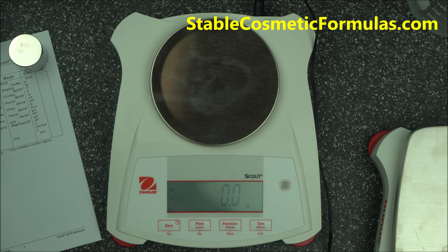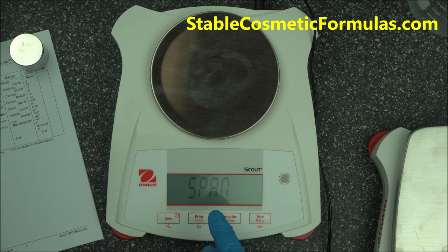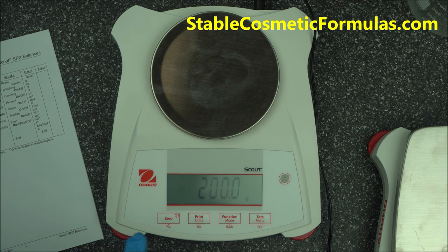To calibrate: press and hold the menu button until you see 'CAL', then press YES. When you see 'SPAN', press YES again to start the calibration. It will then tell you the weight to use. If you have the included 200 gram weight, use that. If you don't have that weight, press NO to cycle through other available calibration weights.